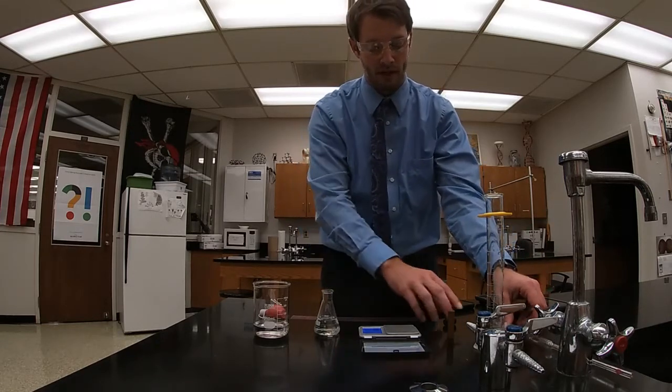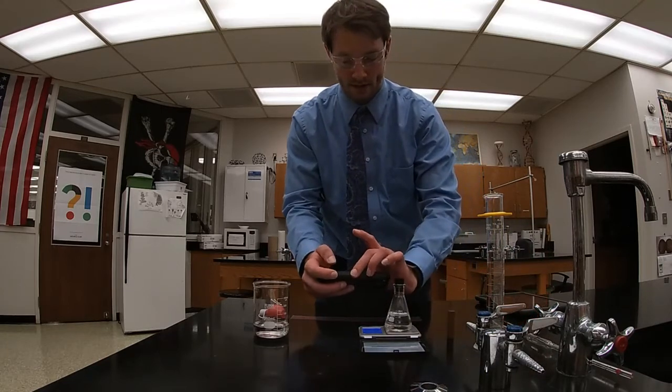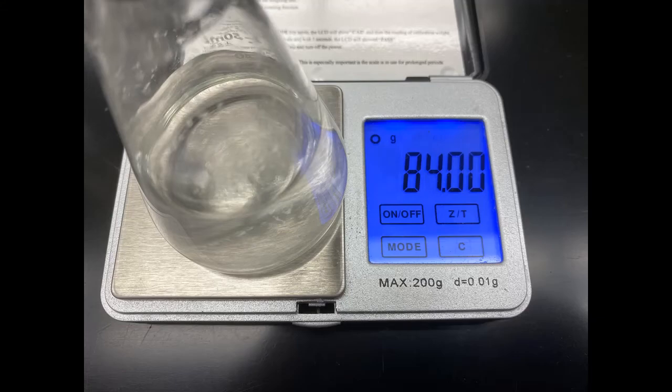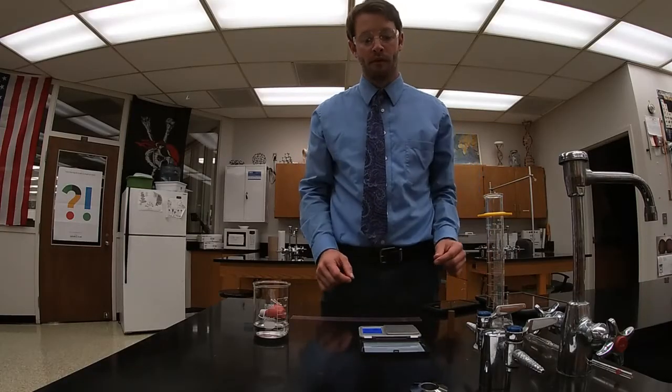Set the pipette aside, stopper it, and get my final mass. Okay, we're done with that part. Moving on to part 3.